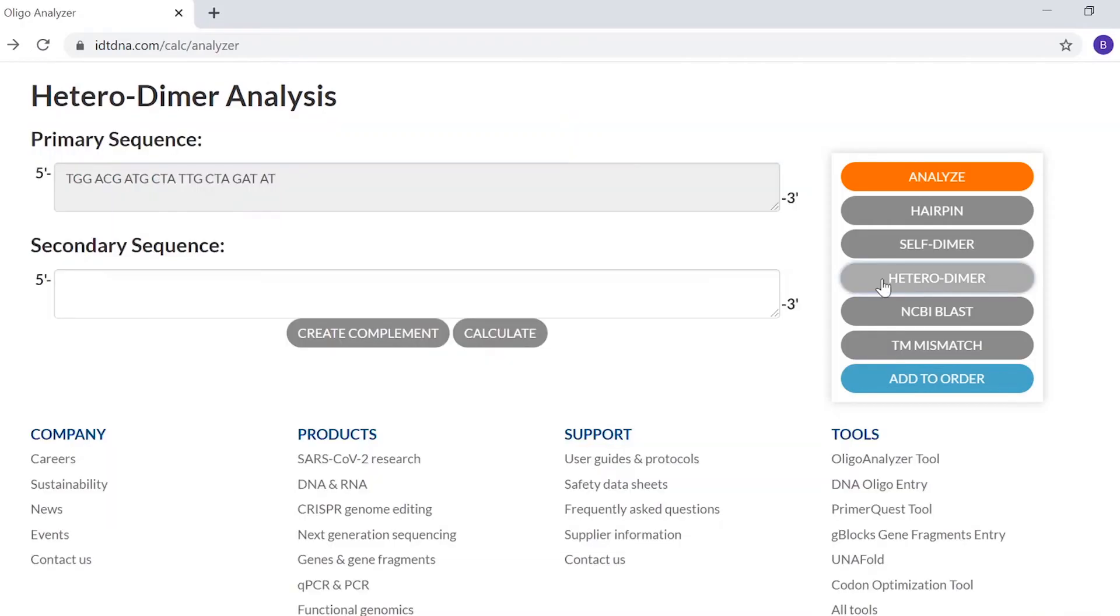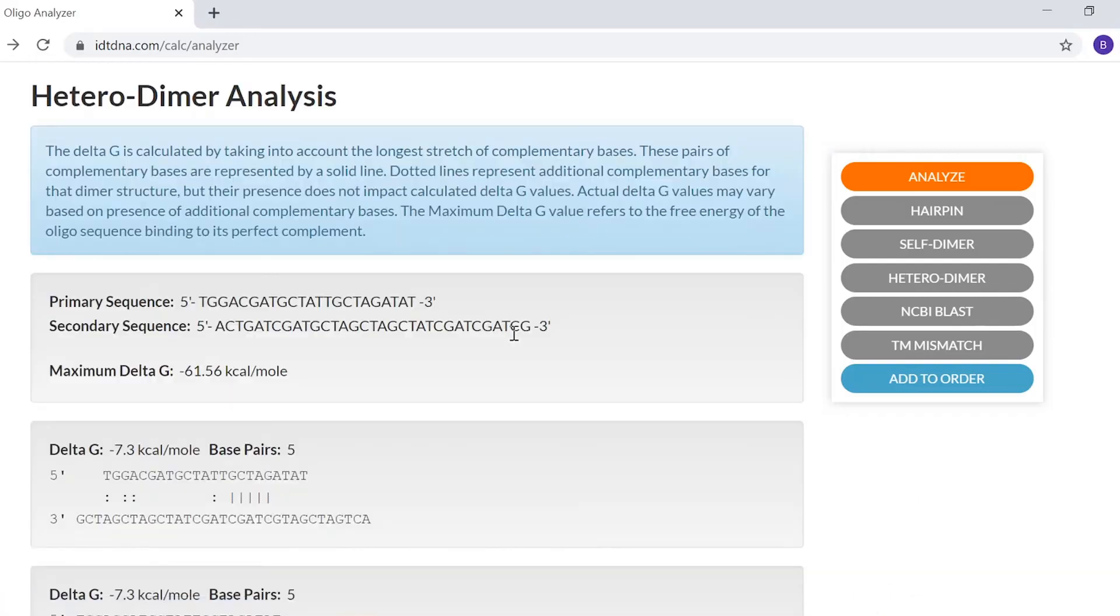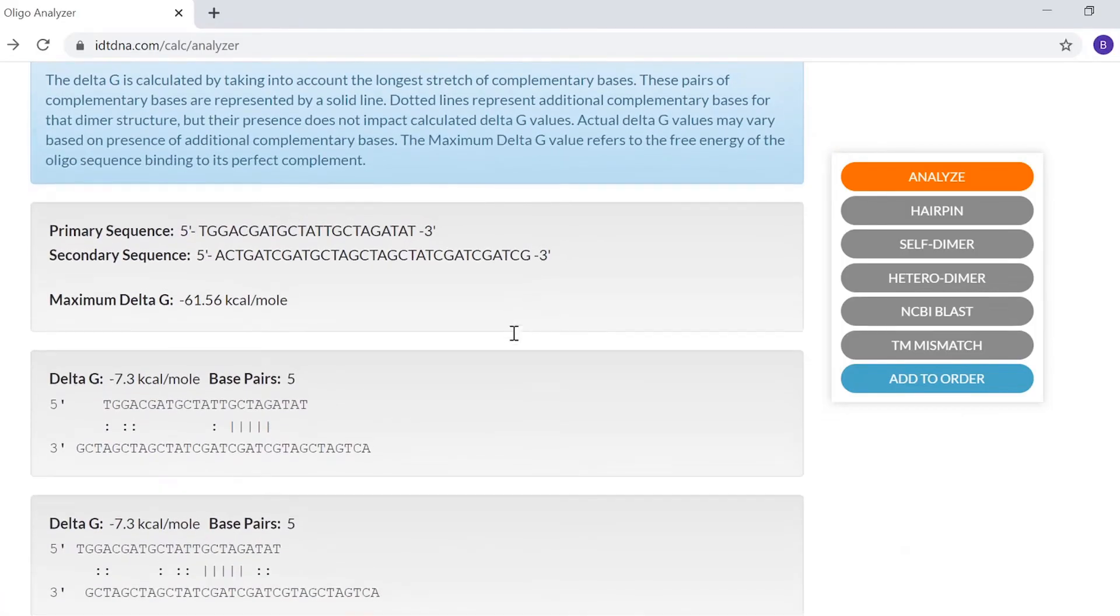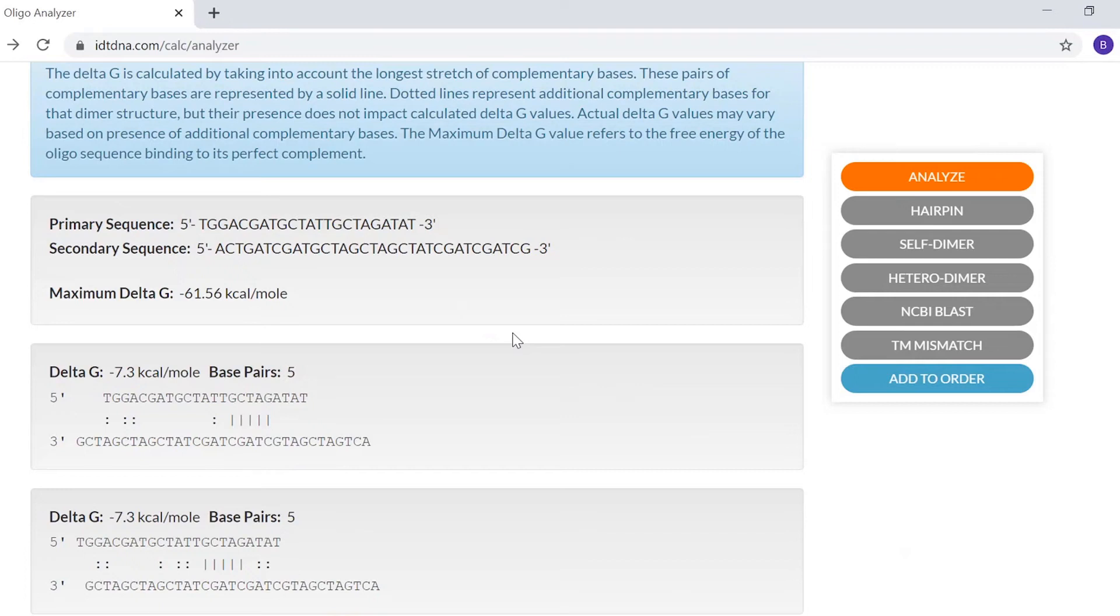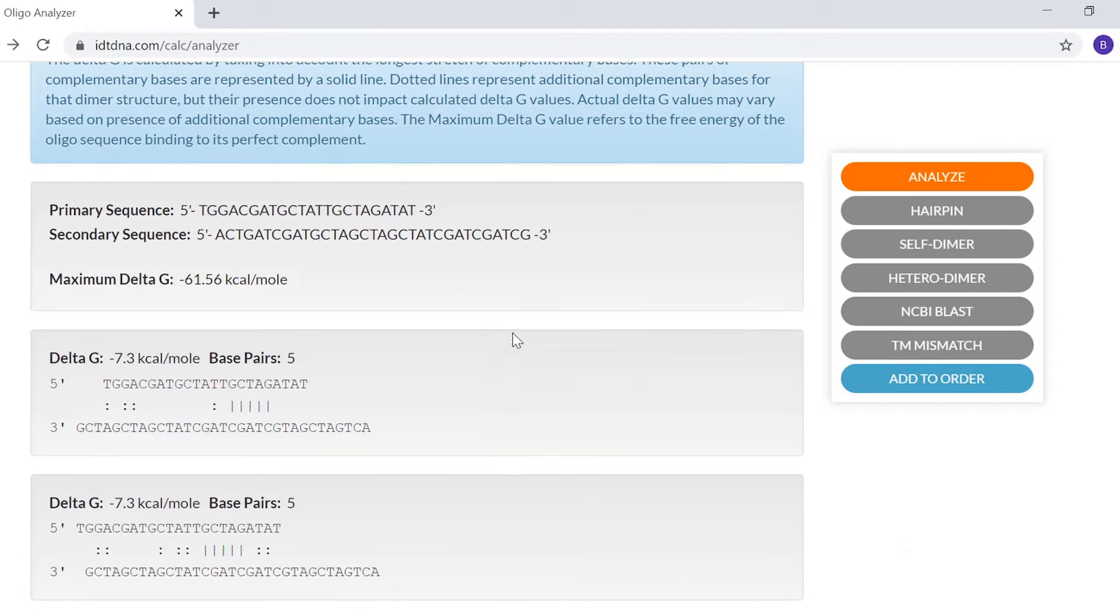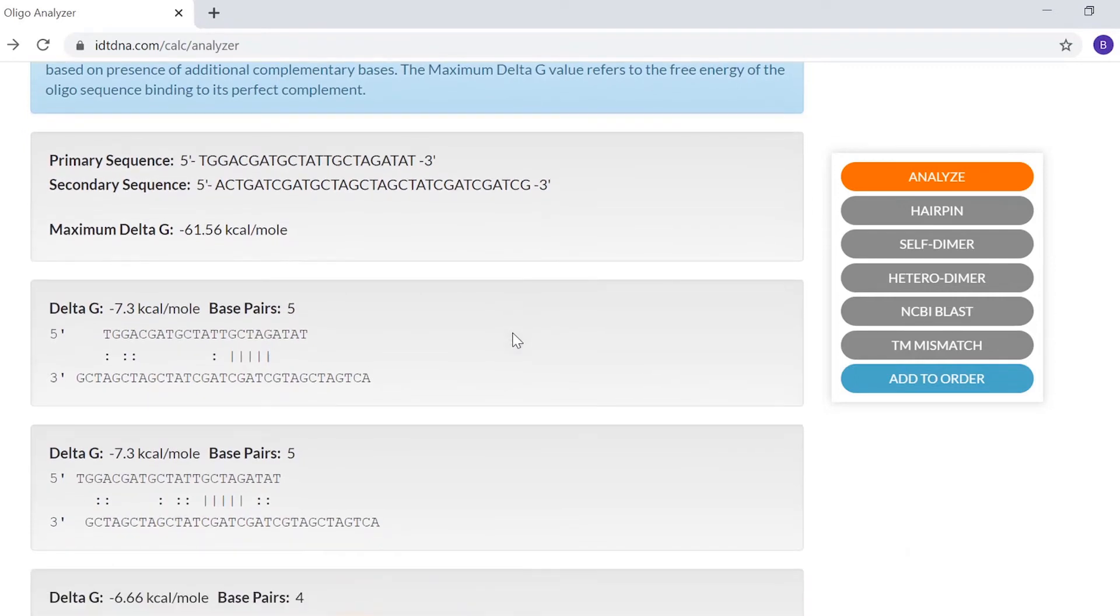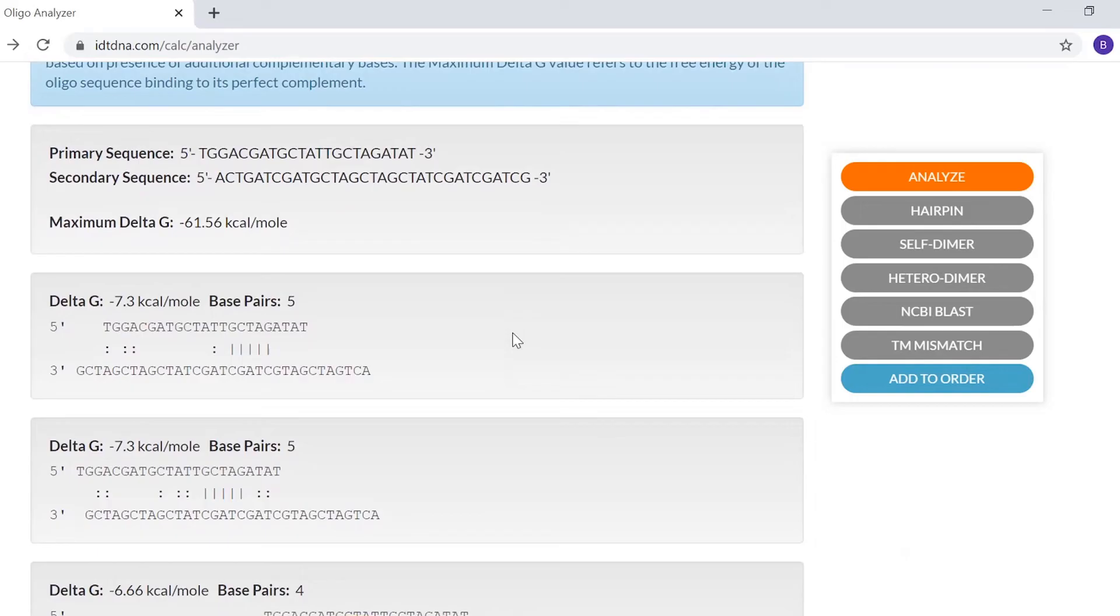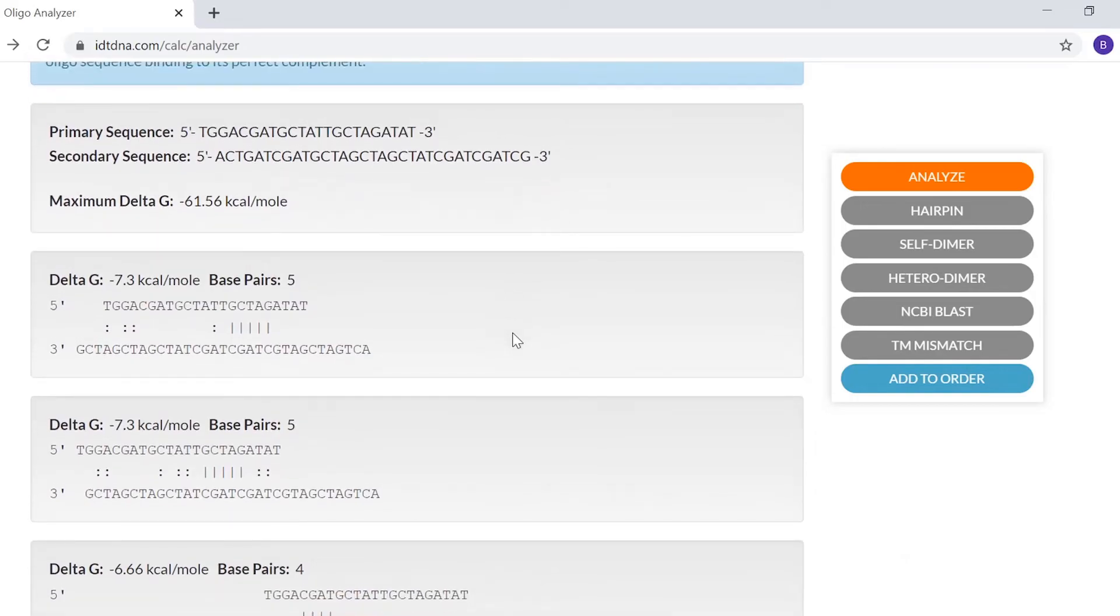Next, we'll look at the heterodimer function, which is similar to what we saw with the self-dimer function. However, with heterodimers, you'll enter a second sequence because you're evaluating the potential for two different sequences to hybridize together. For example, you could assess the likelihood of your forward primer dimerizing to your reverse primer in a PCR reaction. You could also assess multiplexing applications.